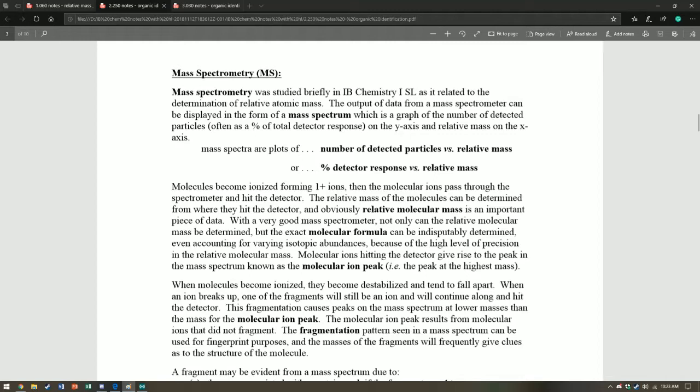just by having that mass spectrometry data, because it's nowadays so accurate that since we know the mass of the individual atoms to such a high degree of accuracy, the computer can actually calculate, okay, what sum of atomic masses will yield this particular mass, because we have such accurate data. So we can use it to get the exact molecular formula and molecular mass of the compound. So there we go. That's two pretty important things right there.